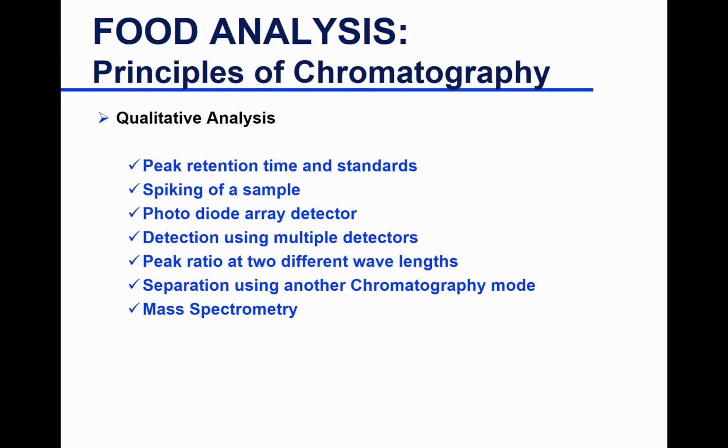So let's say you have no absorption at 200 nanometers, and then as you increase the wavelength, you start seeing some absorption, and then later on you don't see any.